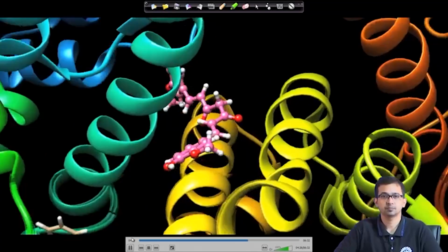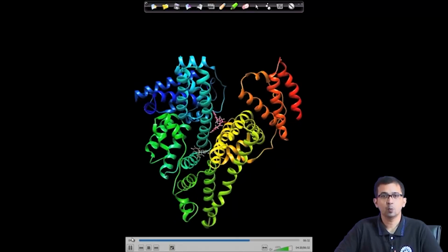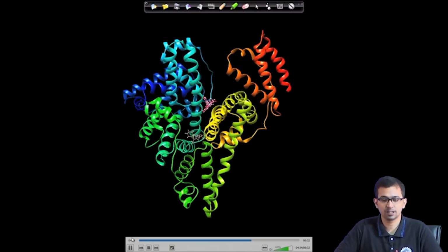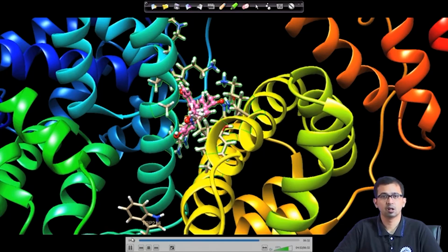This information might be important if we measure the fluorescence emission spectra. However, here also we have seen that curcumin is shielded. Now, we are interested in finding the stabilizing force of curcumin within this cleft of the protein. For that, we need to select this curcumin, allow it to bind to the region of the protein, and select the nearby region, that is, the region around 3 angstrom from this curcumin.